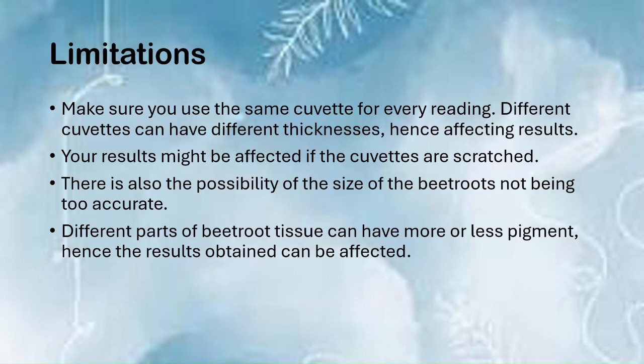So what are the limitations of this practical? Make sure that you use the same cuvette for every reading. Different cuvettes can have different thicknesses, and that can affect the results. Your results might be affected if the cuvettes are scratched as well, so that's also another thing for you to consider.